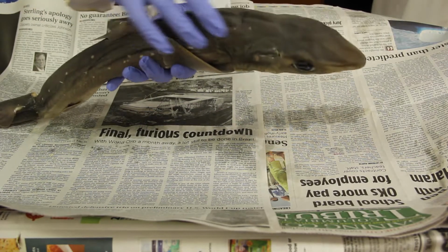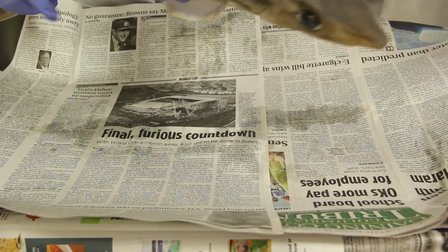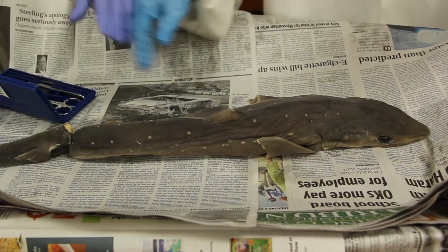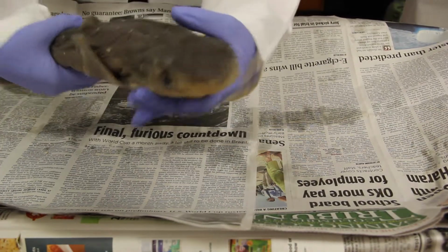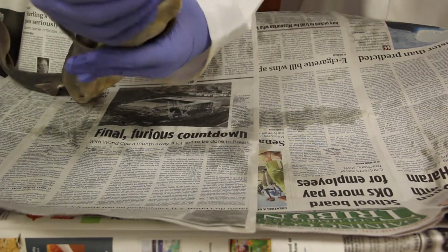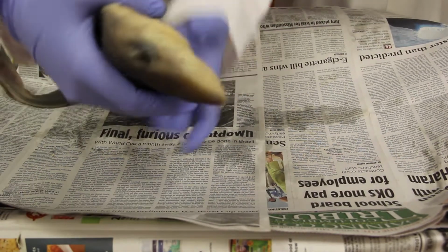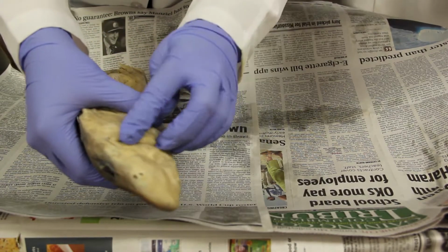The spiracles are these two little dots at the front, if you can see those. That is what takes the water in and helps them breathe in the water. And then if we go to the top, here is its head. This is its nose, and here are its eyeballs. If you flip it over, you can see its mouth, which you can open, and there's little teeth in there.